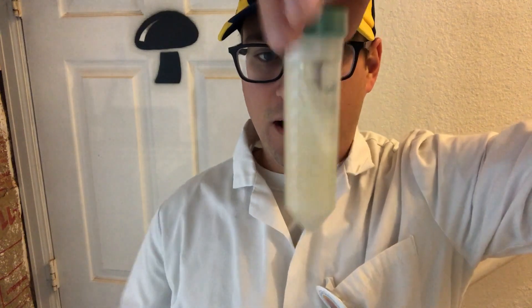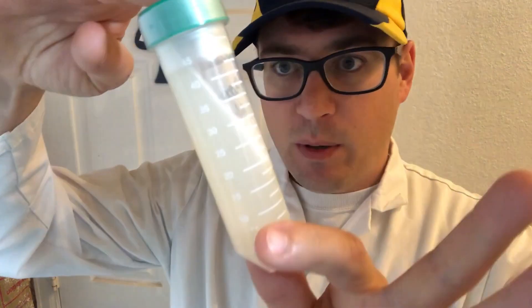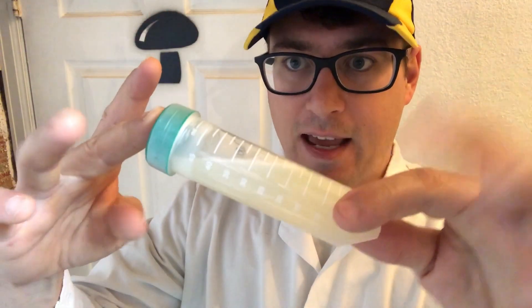There's another term for a culture inside a test tube: it's called a deep. A deep is when you let the agar dry straight across, and those are used for identifying certain anaerobic bacteria. A deep is different from a slant.